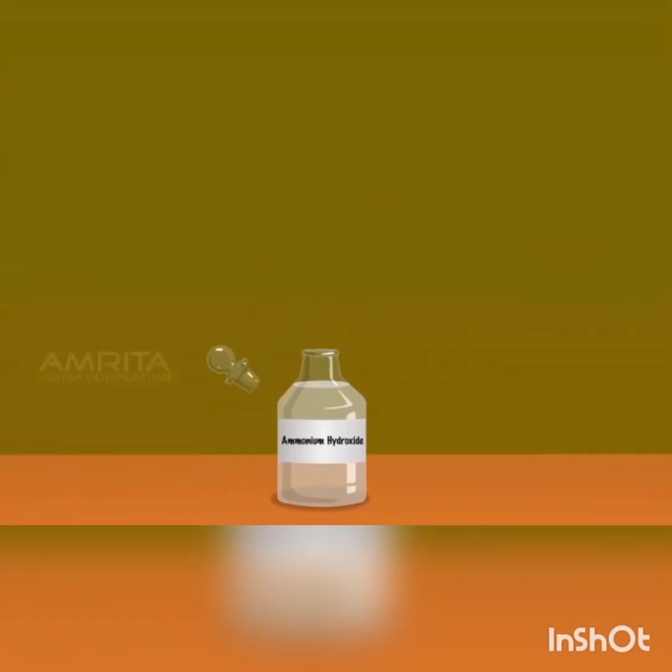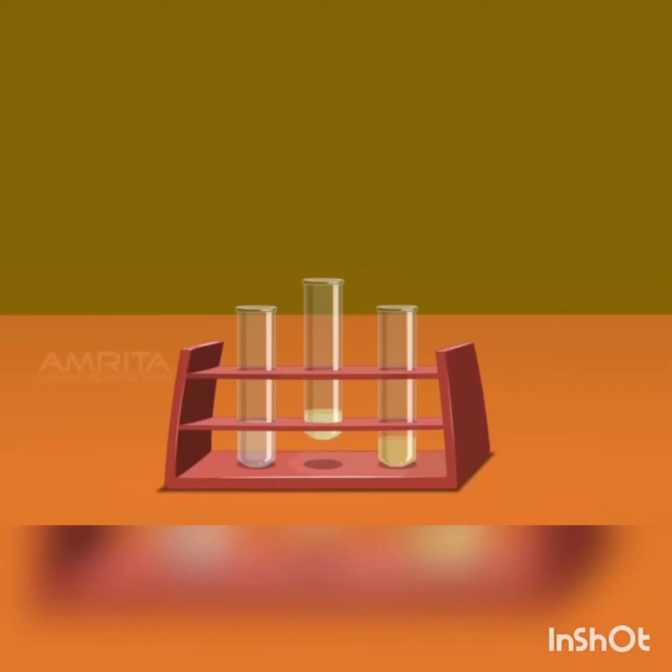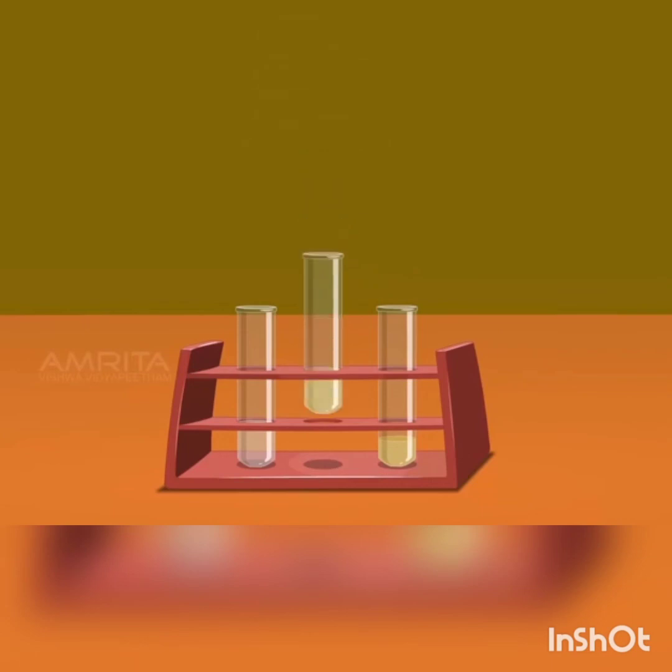Take ammonium hydroxide solution using the dropper. Take the test tube containing pale yellow precipitate of silver bromide. Add excess of ammonium hydroxide into the silver bromide precipitate and shake the test tube well. Silver bromide is sparingly soluble in excess of ammonium hydroxide.